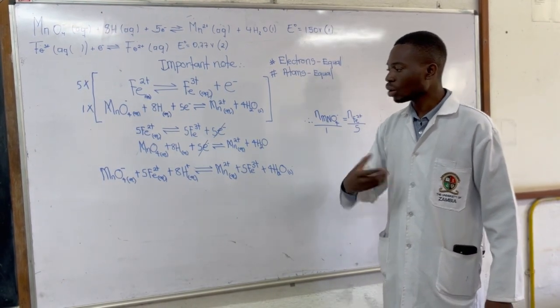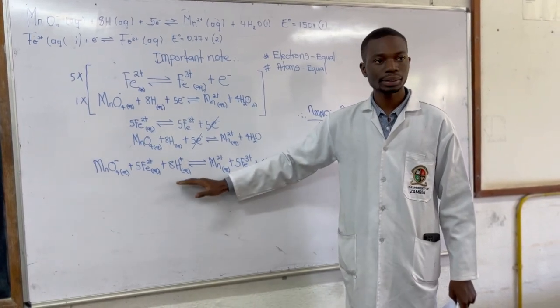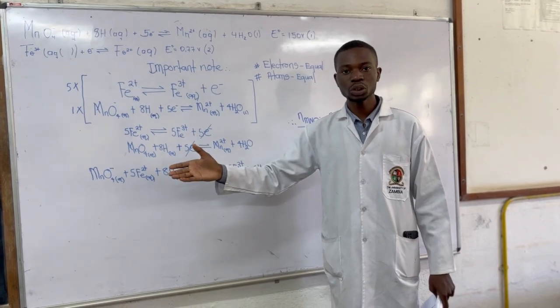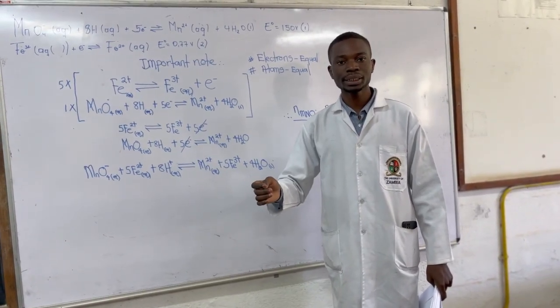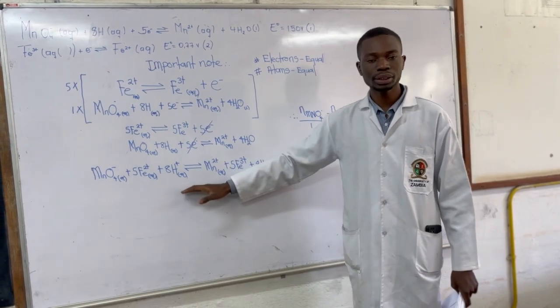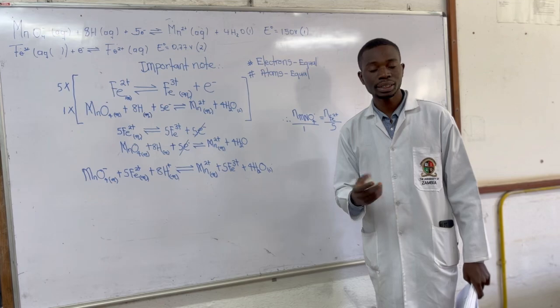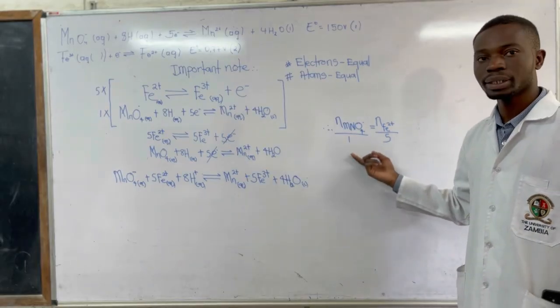In the entire course of this lab session, this is what is relevant. To find the moles and the concentration of the potassium permanganate, this is what we're going to be using. When you get back to your lab manual, you'll be given something very important, these formulas here.